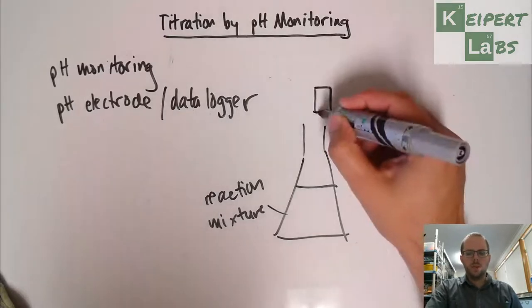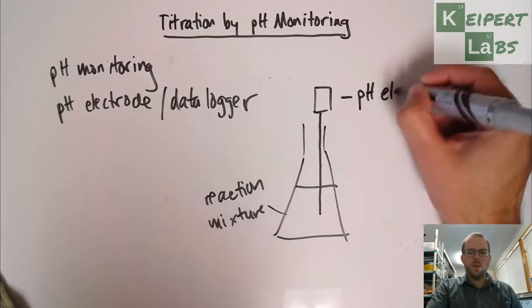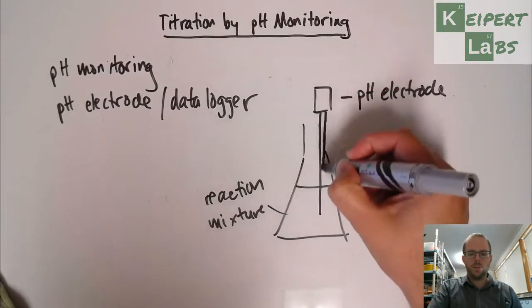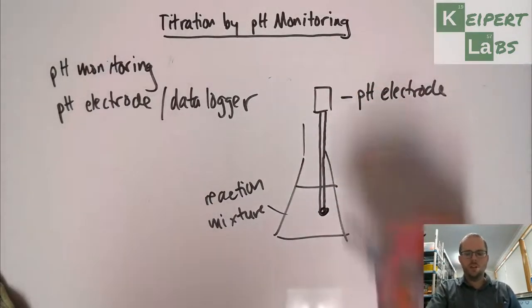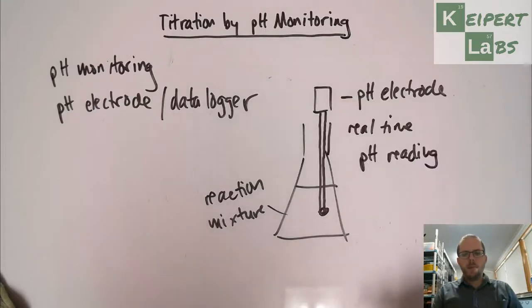We have a pH electrode. We've used bulkier versions of these before, but we would tend to use a finer one. What it does is that it gives us a real-time pH reading. And so by monitoring the pH as we've added particular amounts of reactant, we can identify where the equivalence point has been reached. Now I'm going to show you how that works.